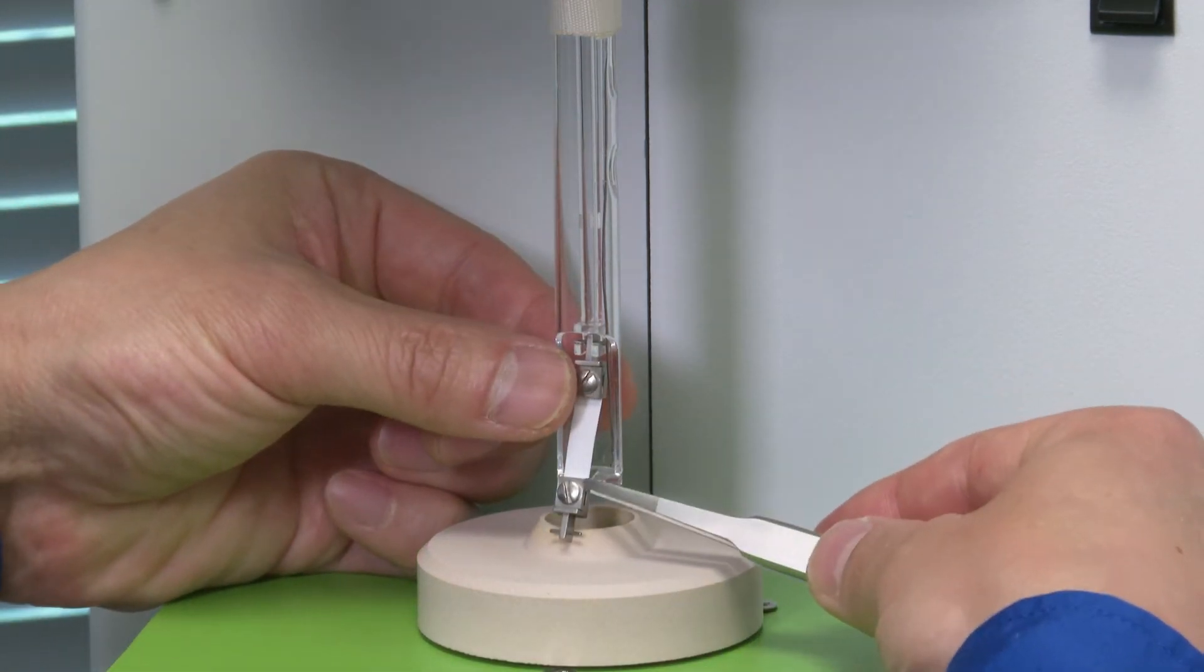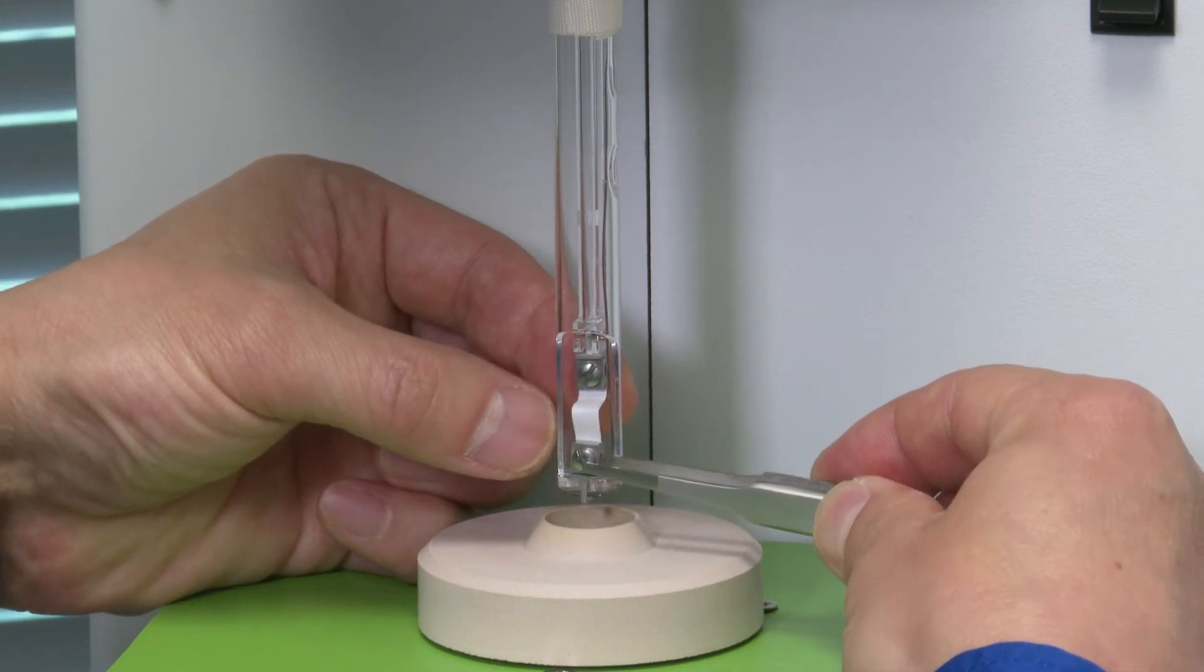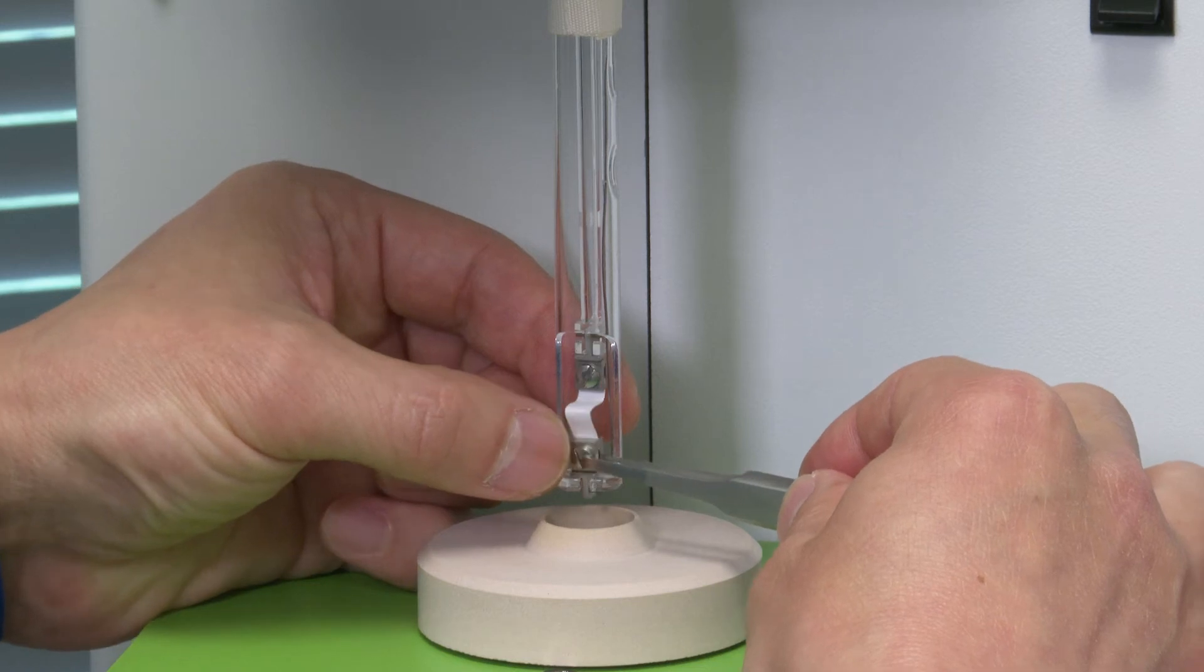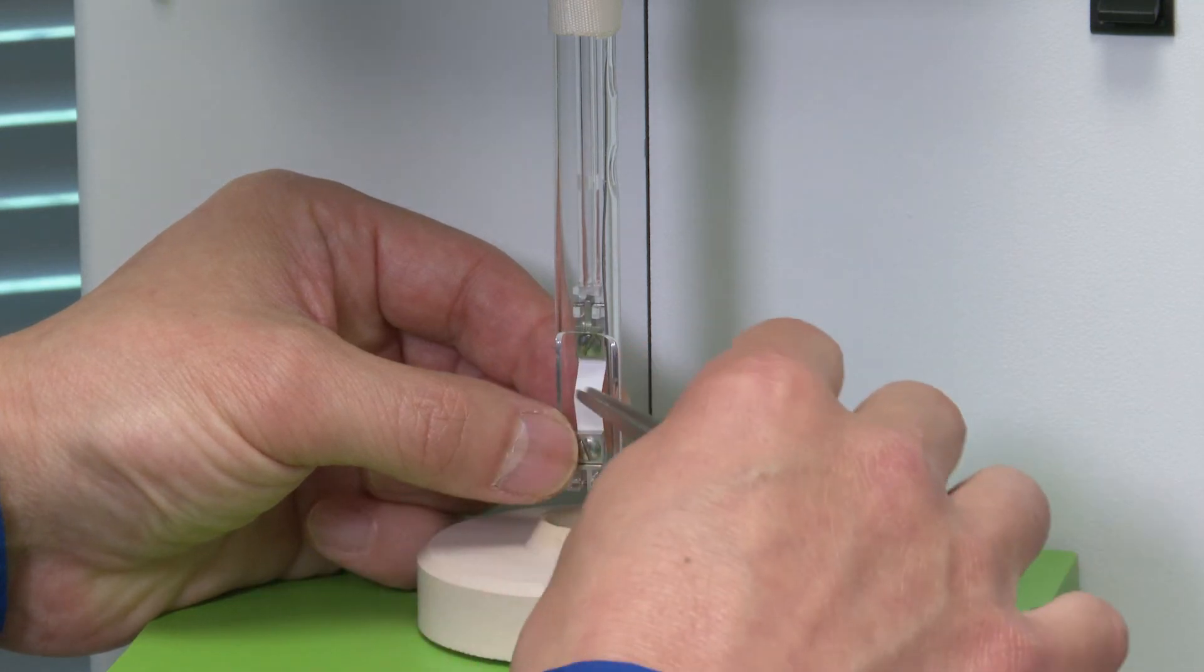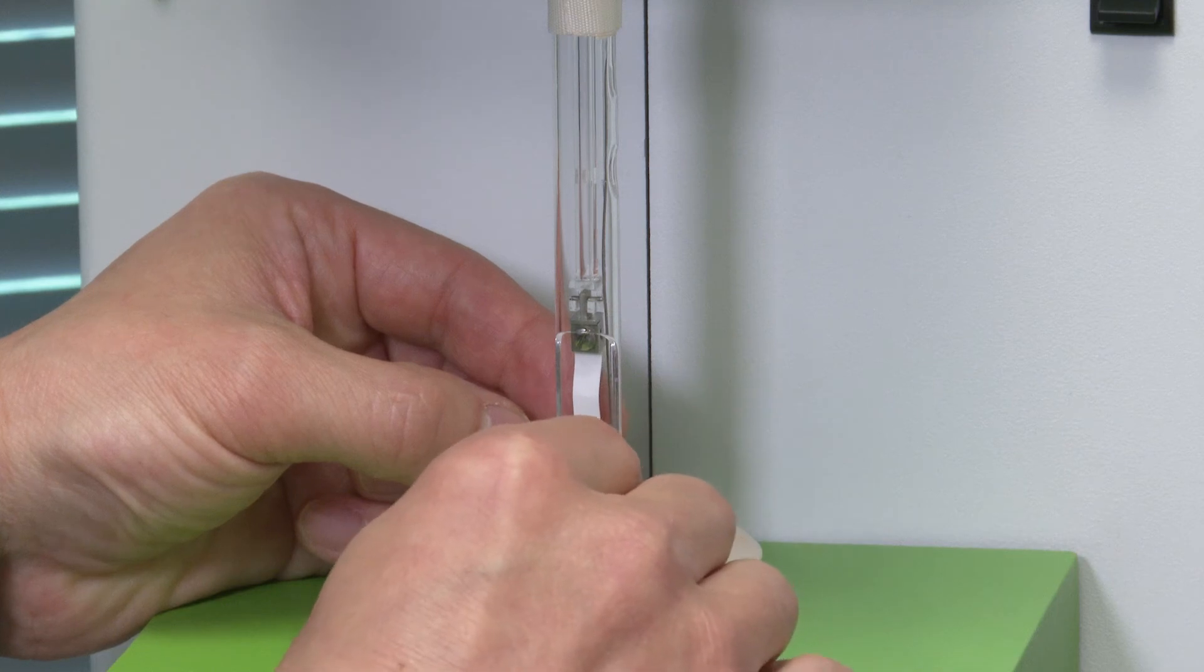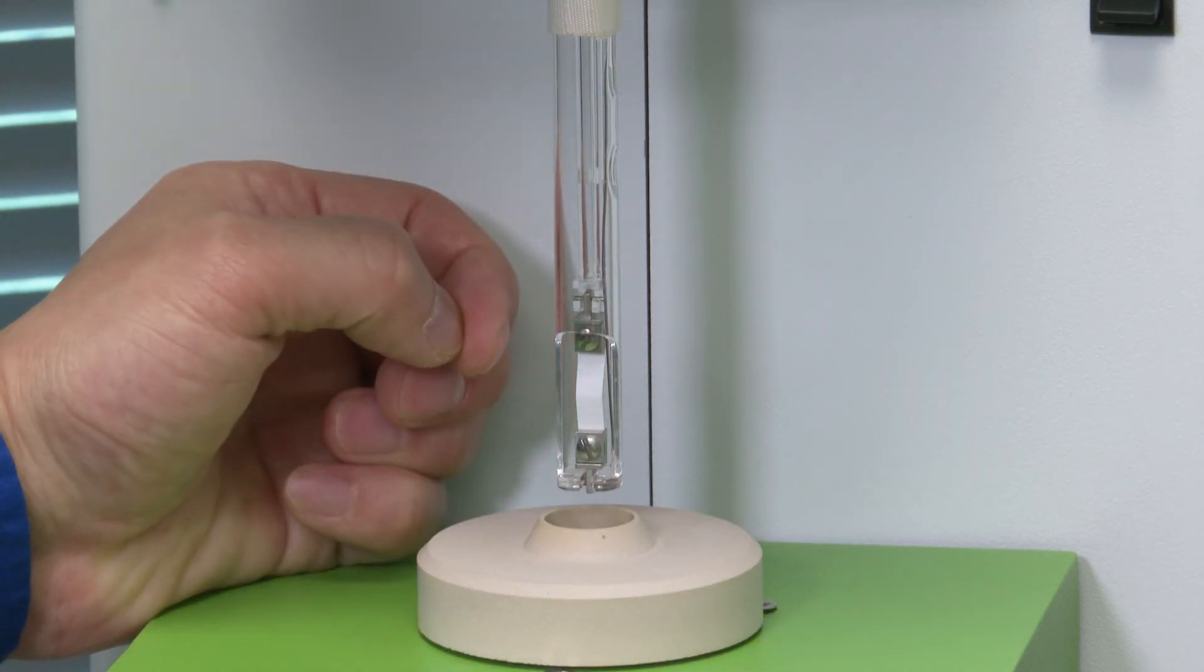Then you can put this lower clamp into place and lift the probe. Make sure the lower clamp fits into the groove under the platform.